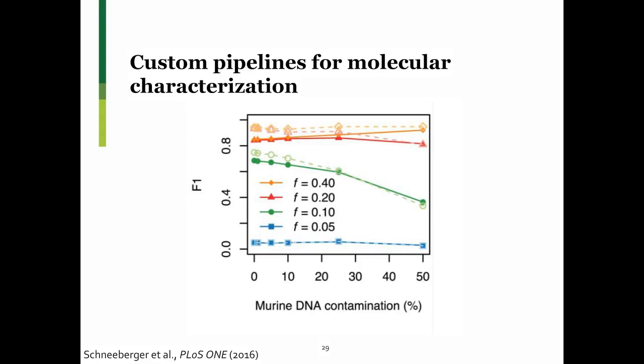And we think that this is really driven by loss of overall total depth. So as your sequencing depth drops, you really lose the sensitivity and specificity.